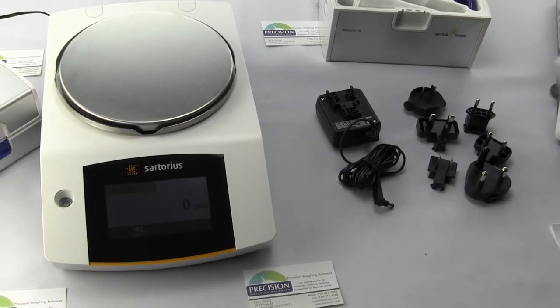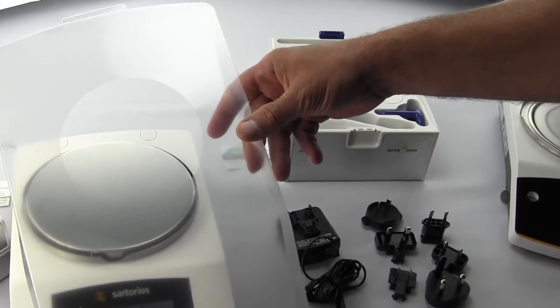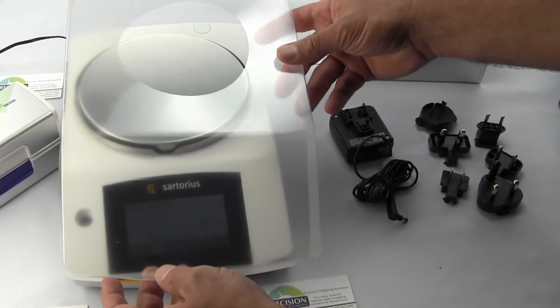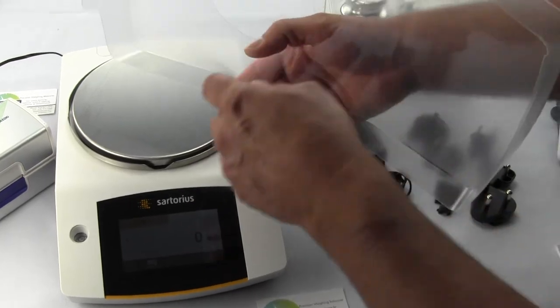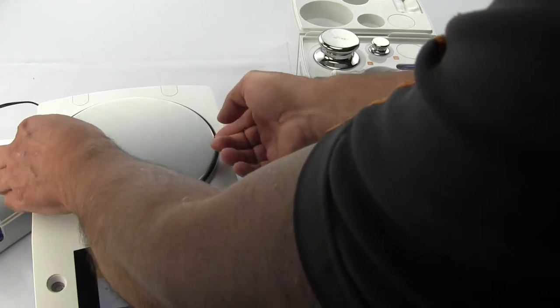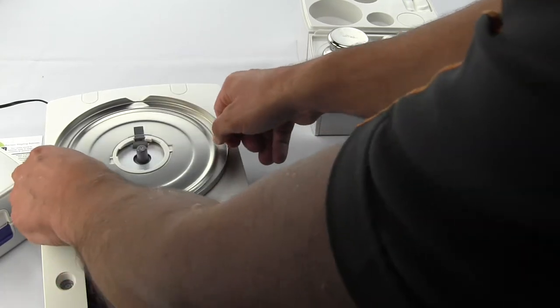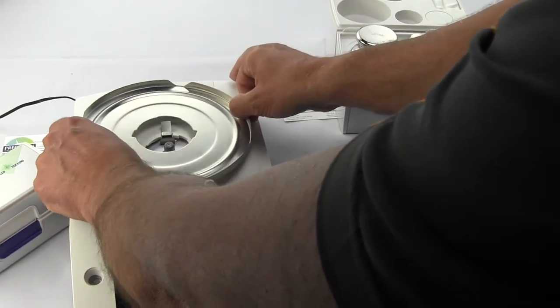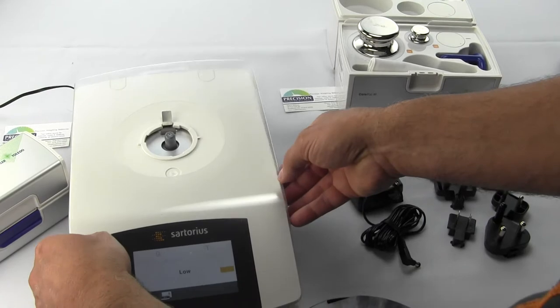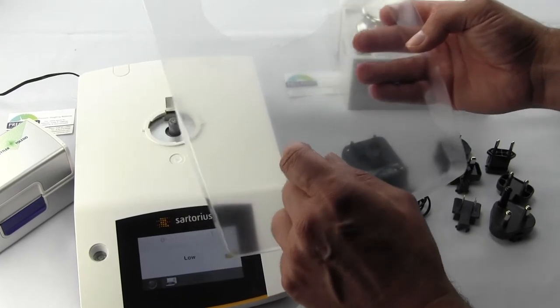You also get one splash guard that comes with the unit. This is a transparent plastic in-use cover to prevent splashes. You'll notice there are glue tabs, so it just covers over the balance. You can buy additional in-use covers, but they're pretty expensive—like $57 each from Sartorius.